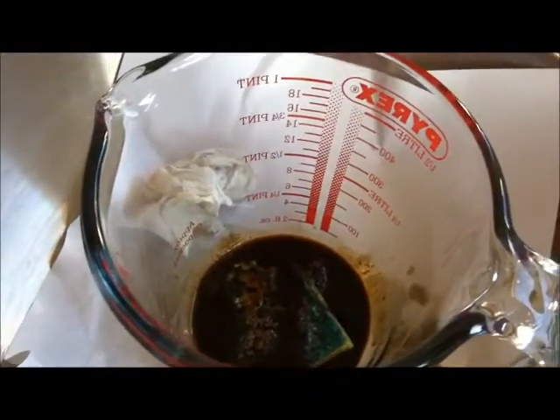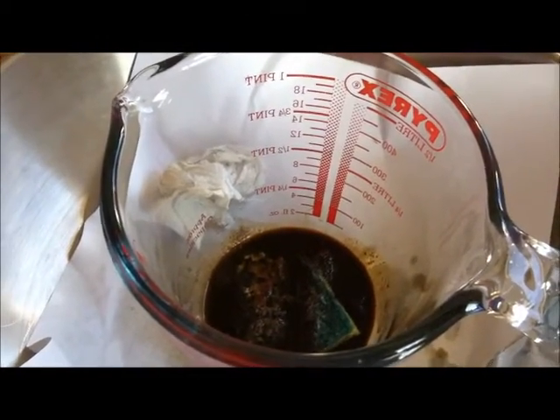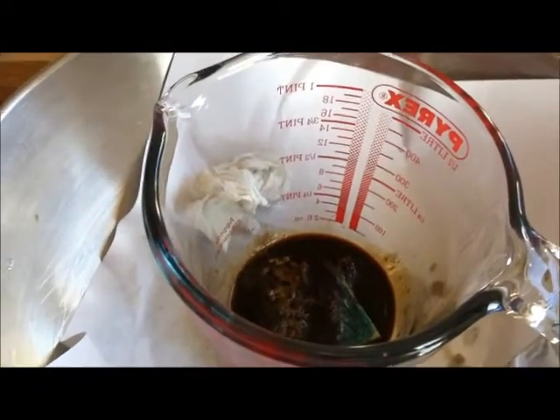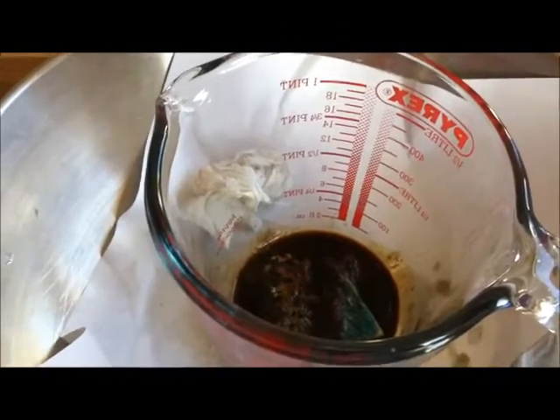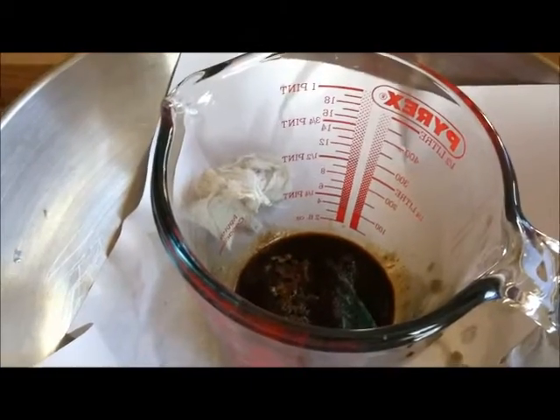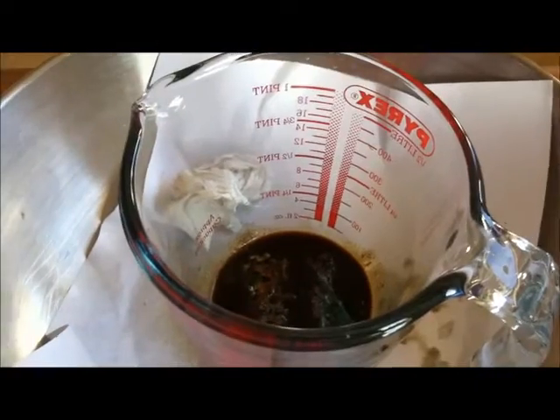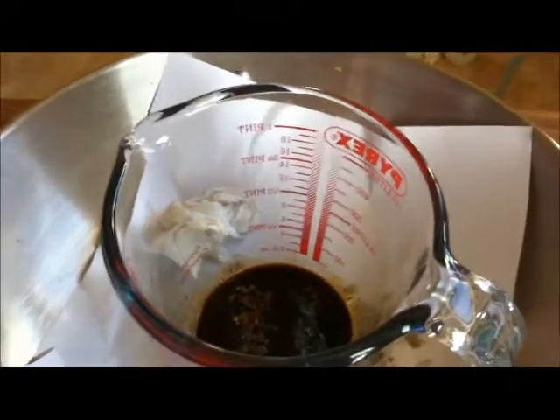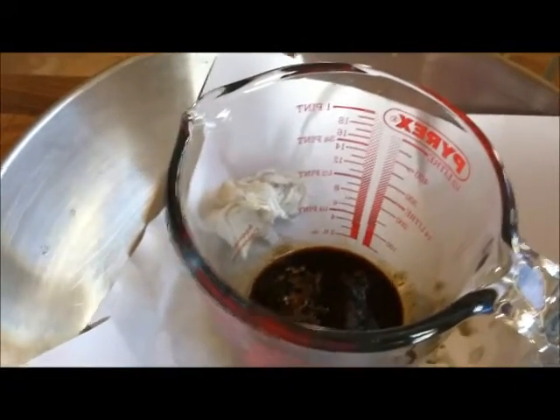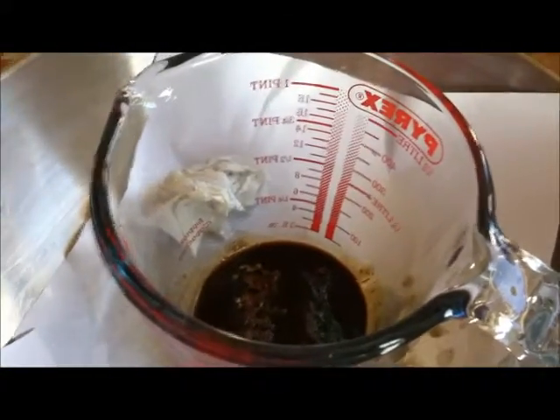Just be careful where you use it. Use it outside, I'd recommend. Don't use it near any food preparation equipment or anything like that. And if you do spill it, use lots and lots of kitchen roll to soak up the excess acid, then you can try using water or detergent on it. Don't use anything bleach-based or chlorine-based on it, as it will release chlorine gas. Don't use a bleach that contains sodium hypochlorite - if you spill this stuff, don't use that and don't be near it with any of that stuff, as it could react and release poisonous gases.